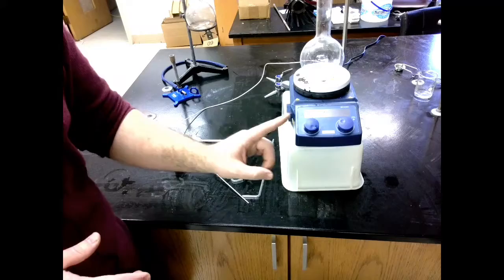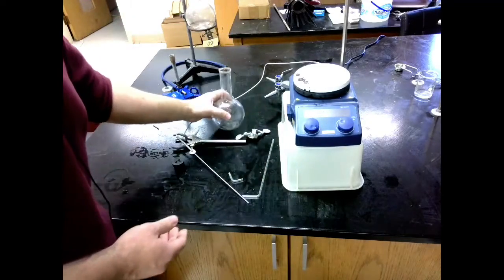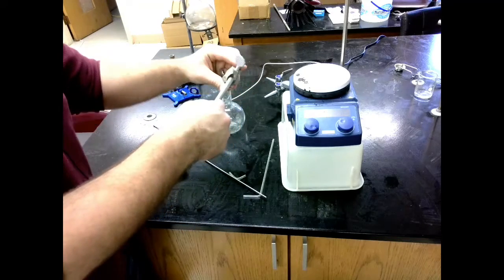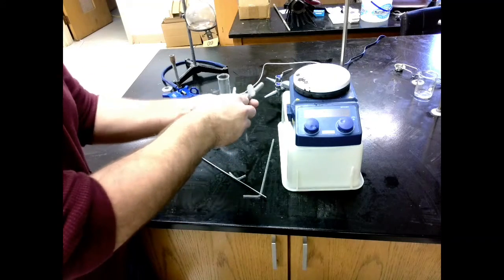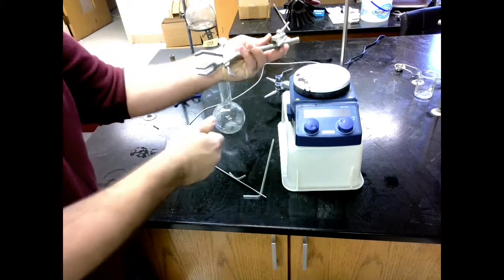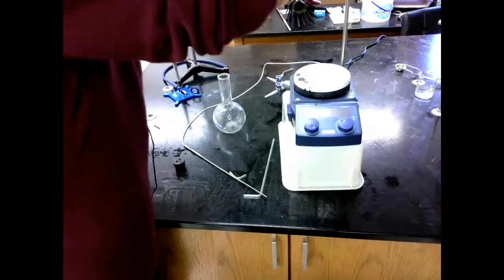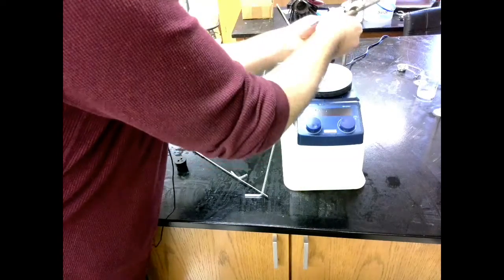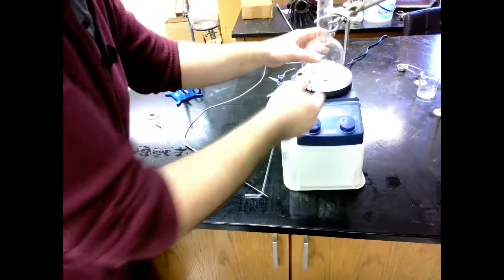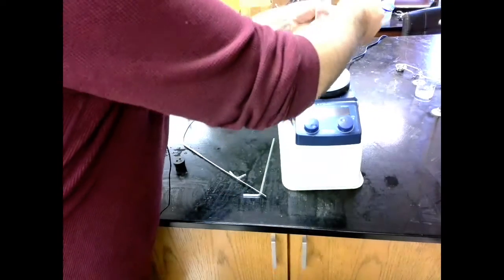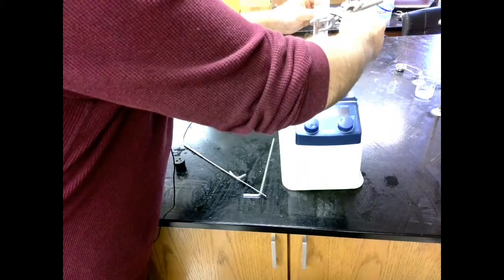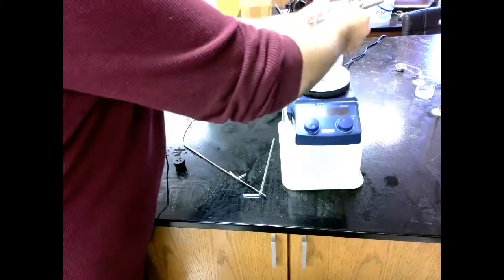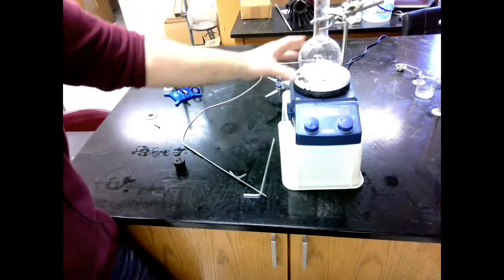So Florence flask, clamp holder, clamp. We're going to set this up first. I place this on. Clearly that's too far away. We're going to move this back in. I'm going to set my Florence flask on top of here. I'm just getting the placement of all of this ready to go. And that's a good height. That's going to hold it nice and steady on the middle of the hot plate.